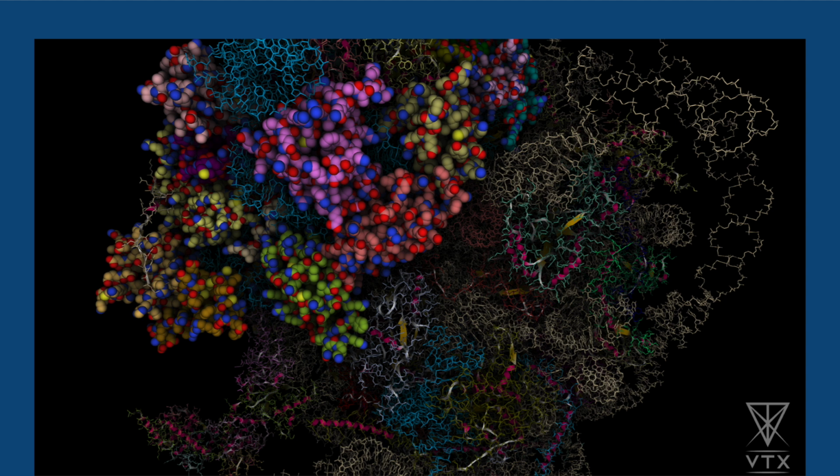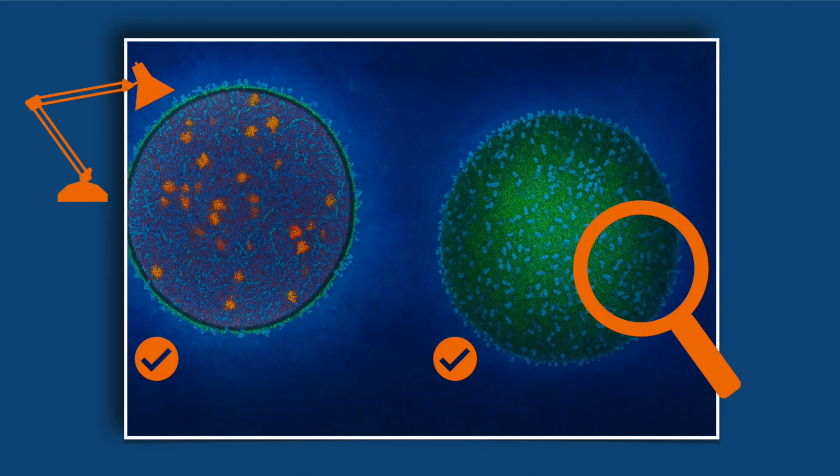The big ones, VMD, PyMOL, and ChimeraX. They used benchmark systems ranging from 100,000 up to that 100 million particle whole cell model. And the results? Quite dramatic, actually. On the 100 million particle system, PyMOL and ChimeraX essentially crashed or froze immediately. Couldn't handle it. Okay. What about VMD? It's known for handling large-ish systems. VMD could load the 100 million system and also a big 11 million atom system they tested, but crucially, once loaded, it basically froze. You couldn't manipulate it, couldn't rotate the view smoothly in real time. So loaded but unusable for actual interactive work.